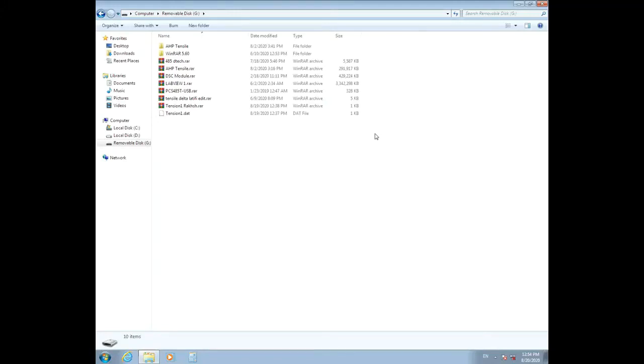Hello everyone, today I want to explain how to prepare your computer for setting up and using the AHP Tensile software. First, connect the USB flash that was sent with the machine to your computer and open it.